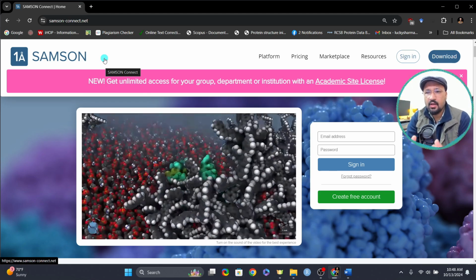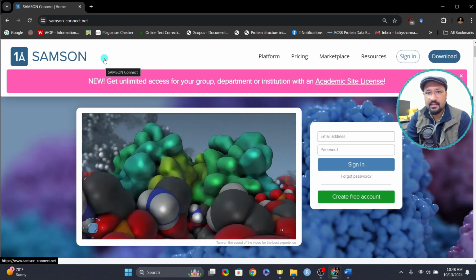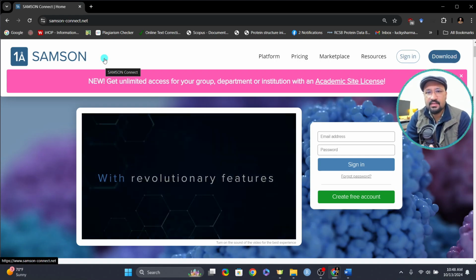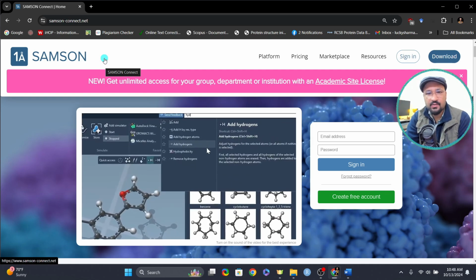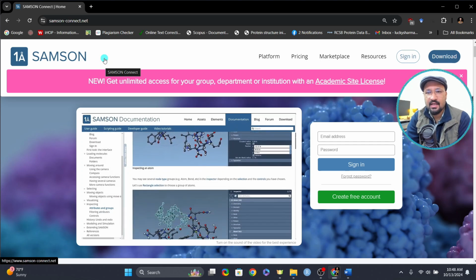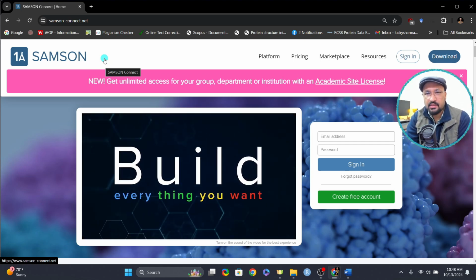There are so many options that are available in SAMSON, and it's recently been updated. Also, a lot of new features are available. I've been using this tool, and I really like using it because there are so many features that are so useful in my research. Okay, so I'm going to show you all those things one by one.